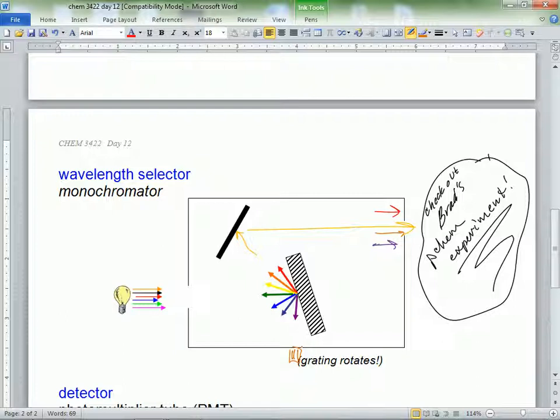I did mark it with tape. So then what kind of compounds do you run through there to analyze? Or what samples do you shine in front? This is just a mercury light. Well, the objective of this isn't spectroscopy. The objective of this is to get Planck's constant.